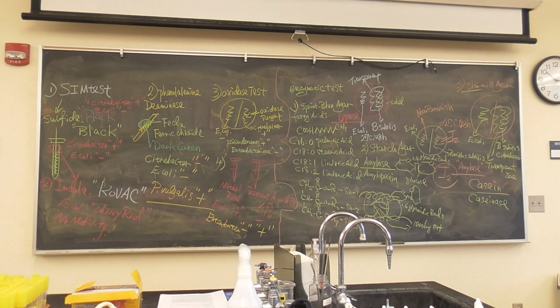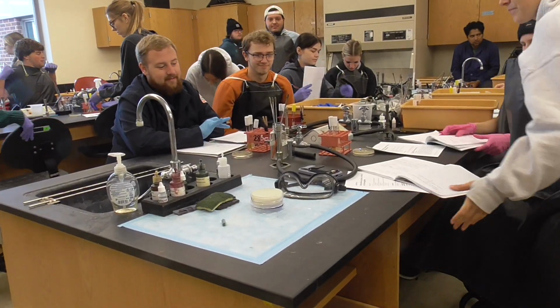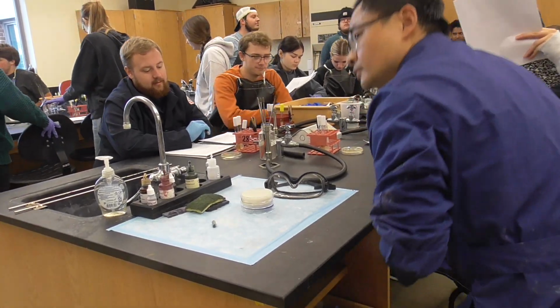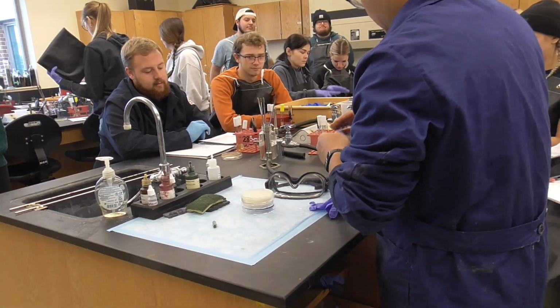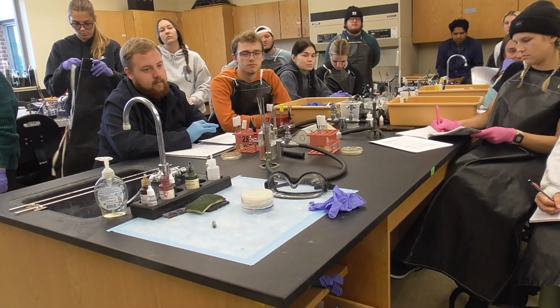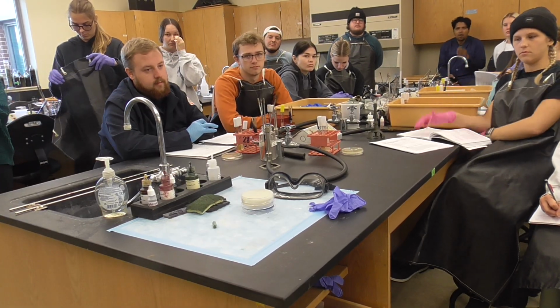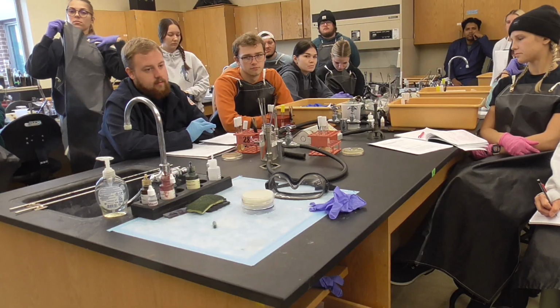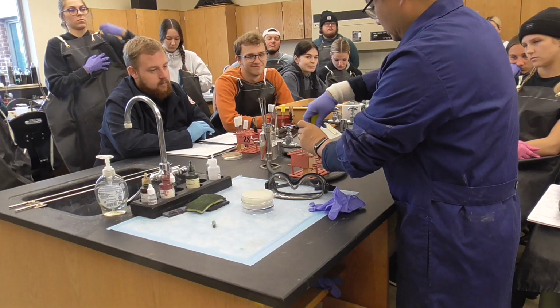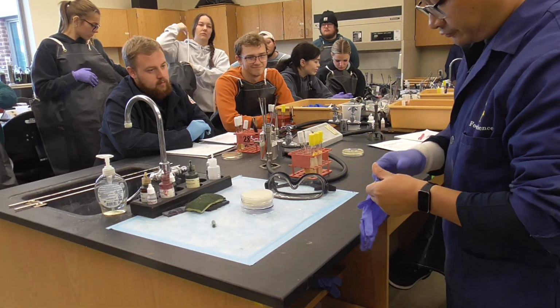Okay, again, everybody come here. I'm going to show you how to do it, because I want everybody to get it. So you will come here to get, let's say, E. coli, Citrobacter, and Bacillus. And again, we haven't used the agar for a little while.